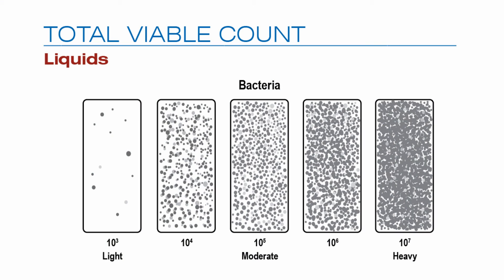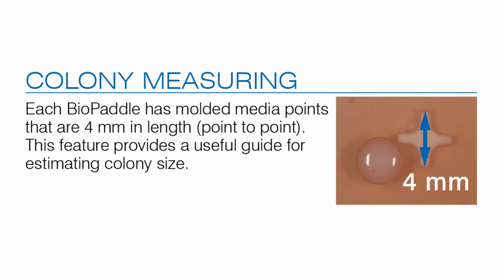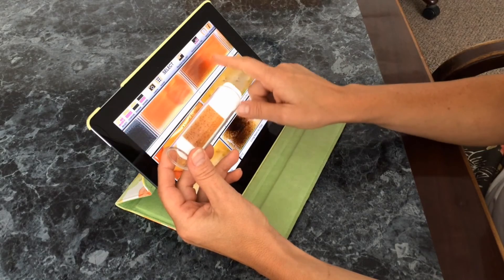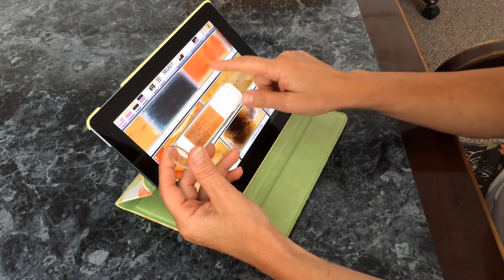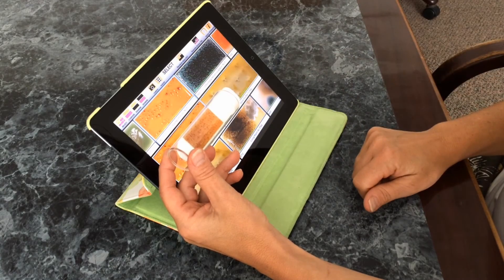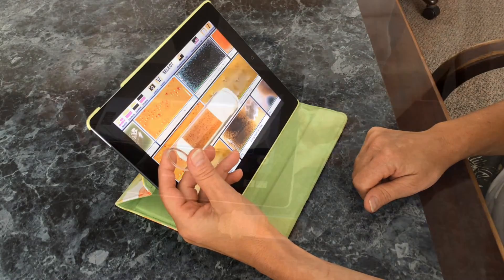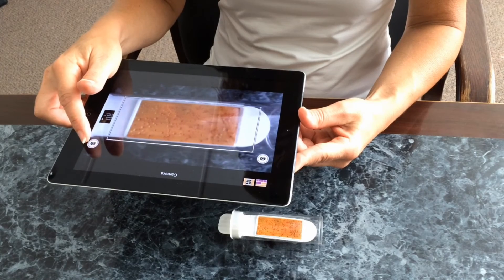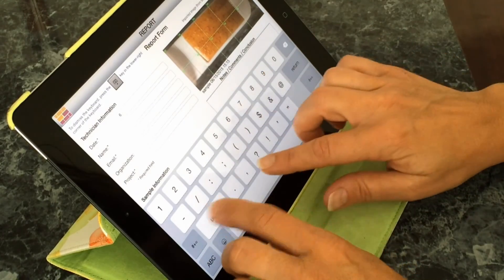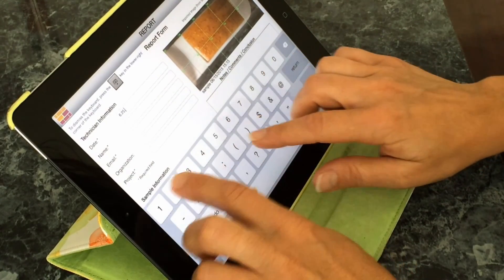Charts may be used to estimate colony counts for liquid, surface, and air samples. Graphics provide helpful information as to colony size. A free Bio Paddle Colony ID Lite app for iPads is included, which can assist with presumptive identification using a library of known microbes. Technical documents on the microbes and agars are included. A full Bio Paddles Colony ID app is available for purchase, which includes camera and report functions to upload a photo of your paddle into the library and report on your findings.